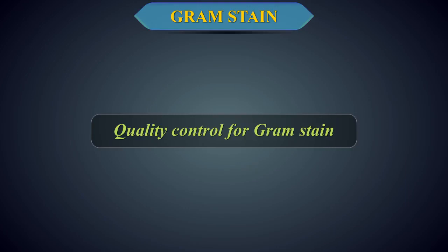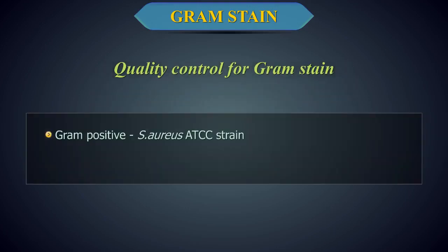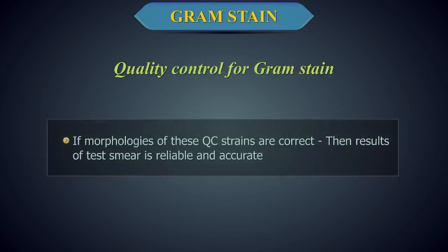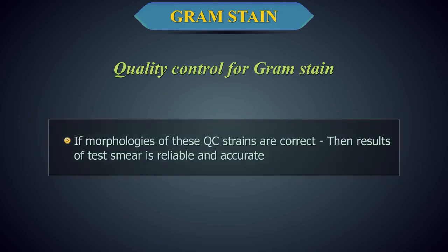Quality control for Gram stain. A known gram-positive organism such as Staphylococcus aureus ATCC strain and a gram-negative organism, for example, Escherichia coli ATCC strain, are used to prepare the smear adjacent to the test smear on the same slide. If the Gram stain morphology of these quality control strains is correct, then the results of Gram stain observation of the test smear are reliable and accurate.